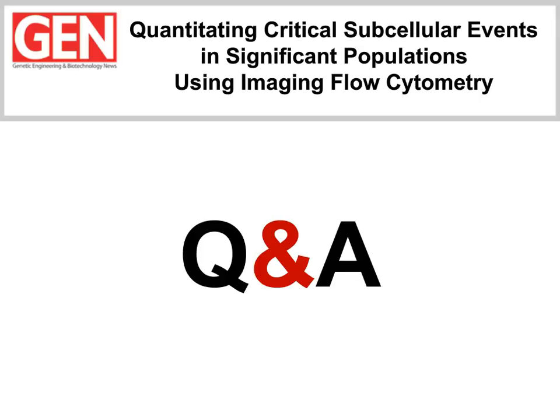Well, we've got a number of groups in our division that are now getting invested in using the imaging flow cytometer. So we've got people that are looking at microparticle identification, which is quite interesting. We've got people that are using the ImageStream for things like NF-kappa B, intracellular transcription factor localization. I myself have also looked at apoptosis using things like Annexin V labeling of cells. So those are some of the interesting applications that we've used.